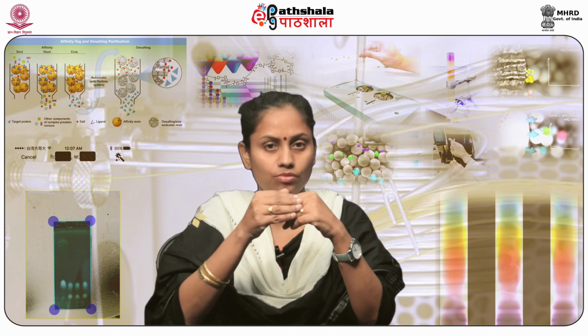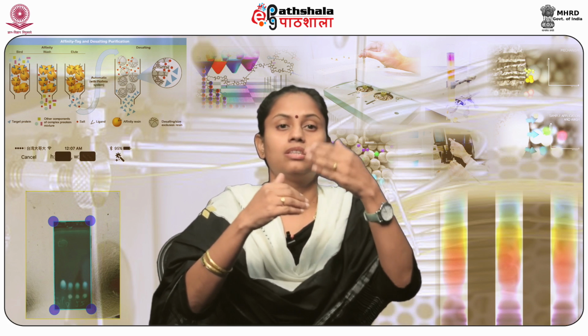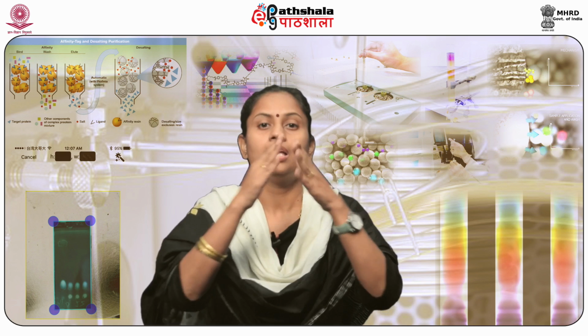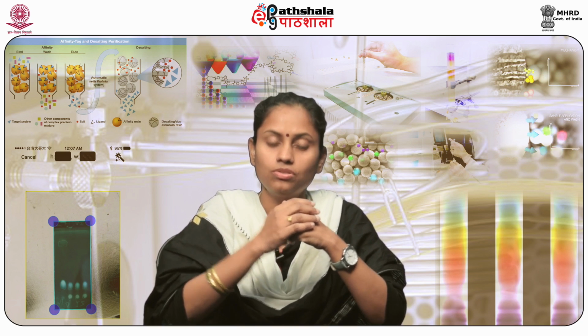The different compounds present in the mixture have different affinity towards the stationary and the mobile phase. This basic principle helps in carrying out separation or purification of compounds from the mixture. The compound which has a higher or stronger affinity towards the mobile phase compared to the stationary phase will elute or come out first, compared to those compounds which have a higher affinity towards the stationary phase.